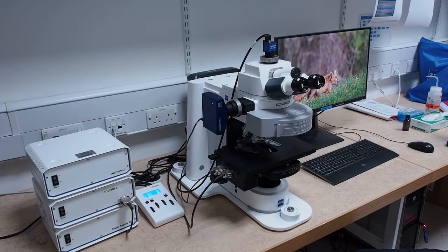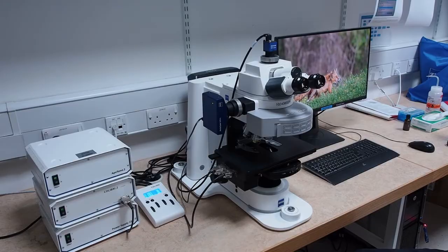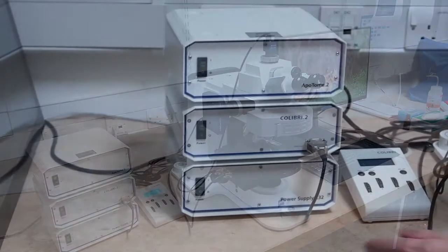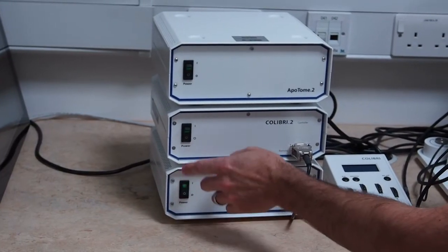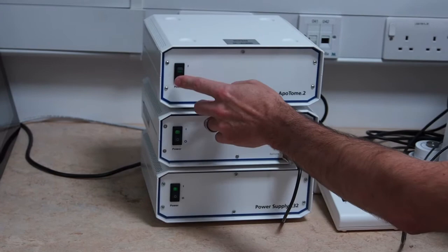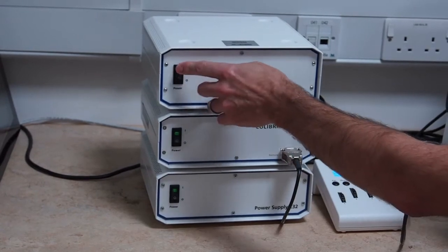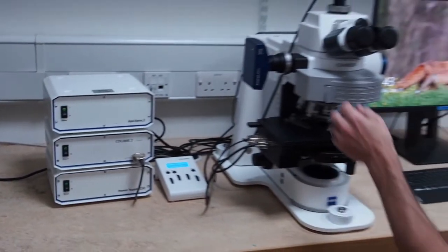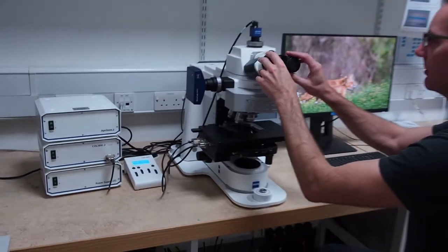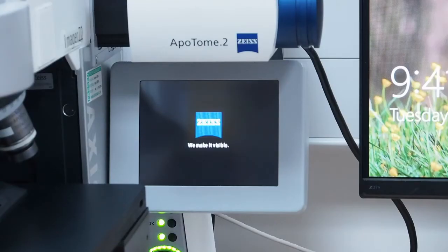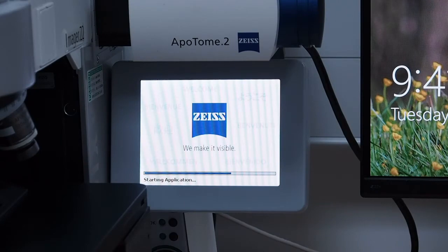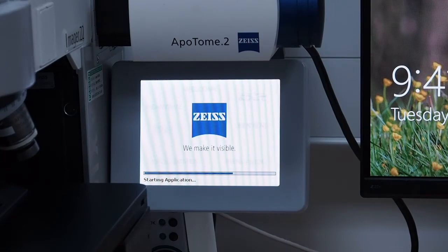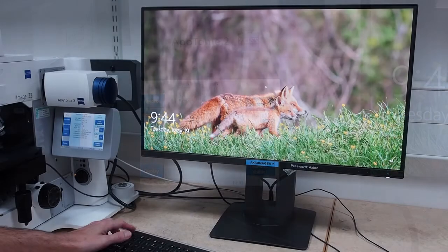This video shows you how to start up Zeiss Axio Imager 2. Firstly, switch on the three boxes on the left hand side and then remove the ocular cap from the microscope. Now wait for the microscope LCD touchscreen on the right to finish booting. This is apparent when the home screen appears.